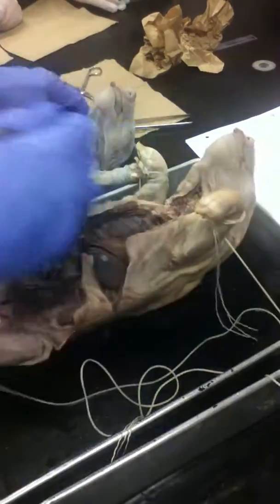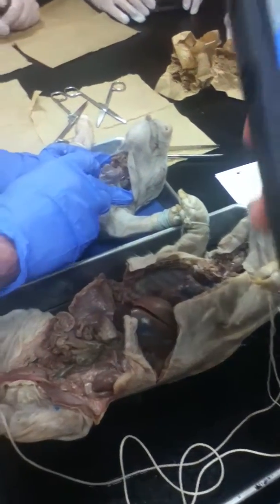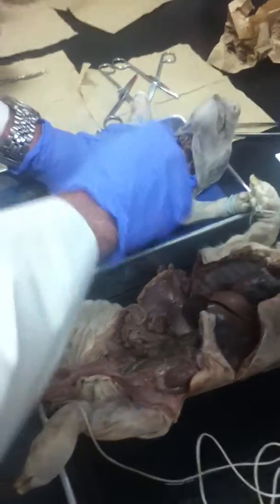Salivary glands, right there. These two things here, big things off to the side. Those are the salivary glands. Okay. And that's it for that page. Can you turn the page for me there?